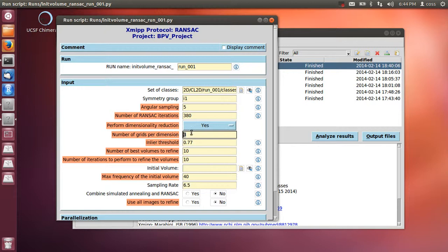To choose wisely these 9 classes, it performs a dimensionality reduction. It projects your classes into the 2D plane, and then in this 2D plane it constructs a map, a grid of 3 times 3, and then it takes a sample from this map.